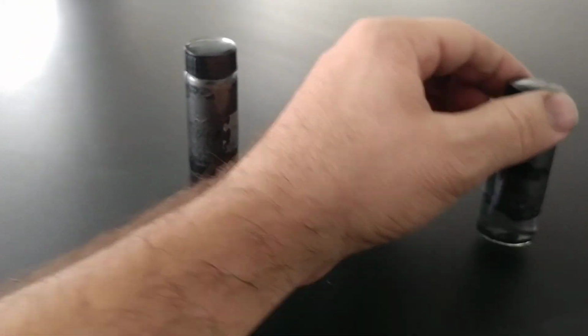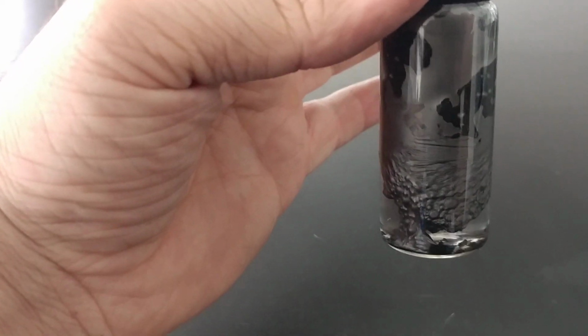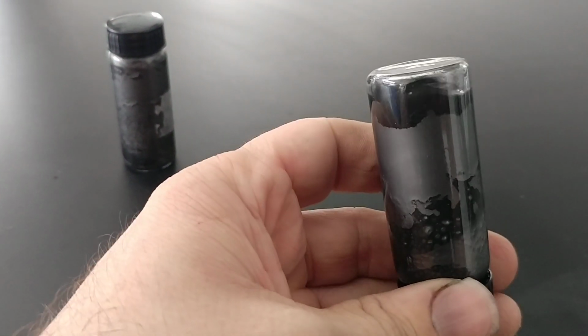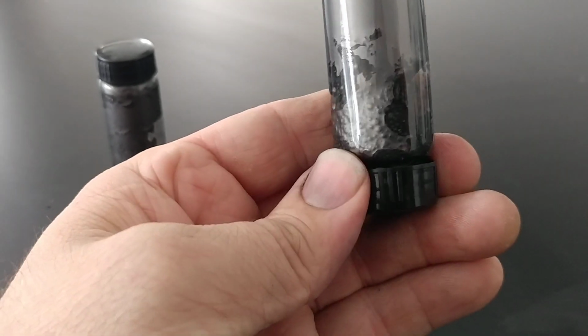If you're dealing with graphene, though, you'll have a serious separation like this in the material. So you can shake it up, and in seconds, boom, you can see that there's a separation there. I mean, you can tip it over and look in the bottom. Oh, look, there's a separation back there. You can see it. Sometimes stuff gets glued to the side, but there we go. We'll spin it around.